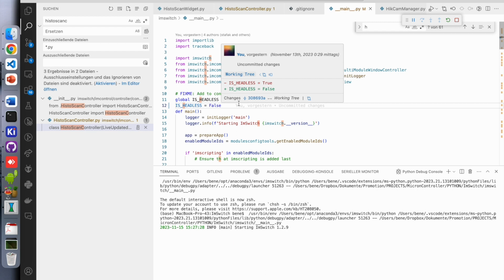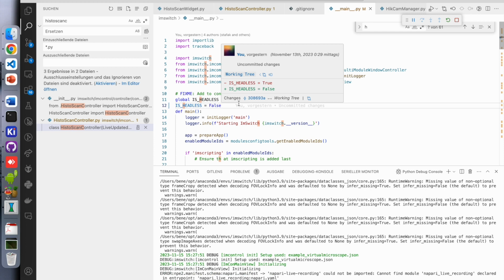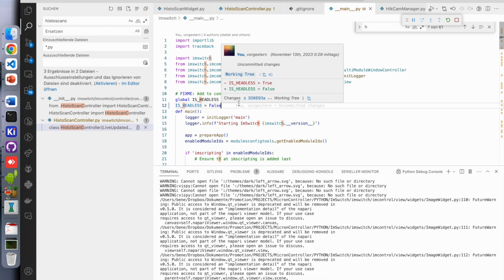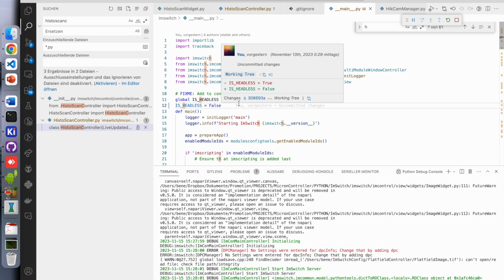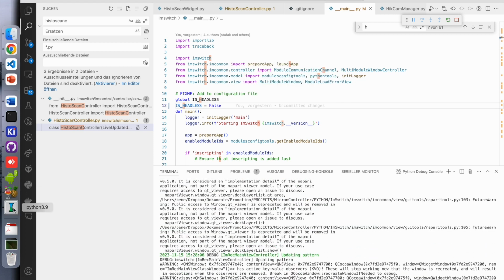So the microscope knows where you are by means of X, Y coordinates. But it does not really know where it is on the sample plane, because the XY stage can be a little bit different, and the sample geometry where the slots for the robots are, for example, are different. And that's where you have to calibrate the position of the microscope with respect to the position of the sample. I don't know whether this makes sense.